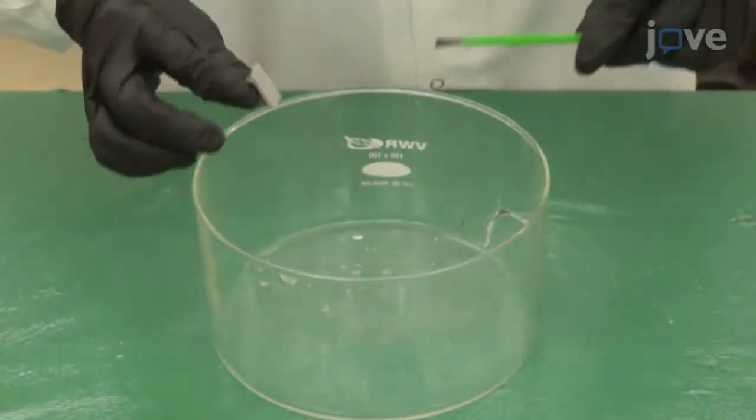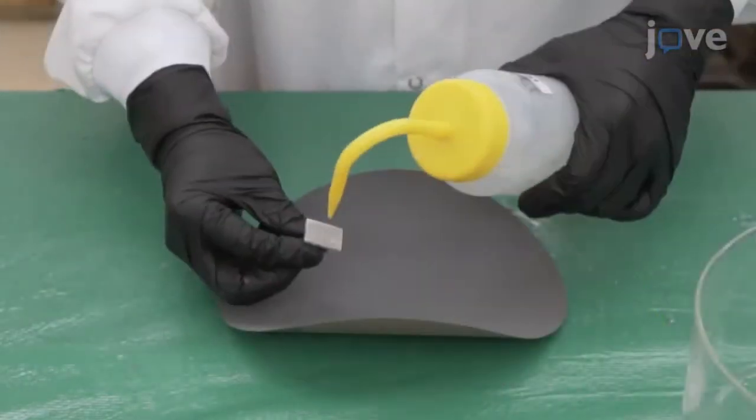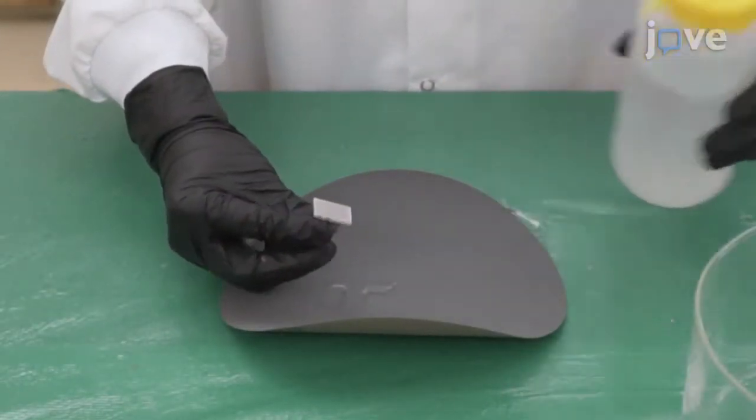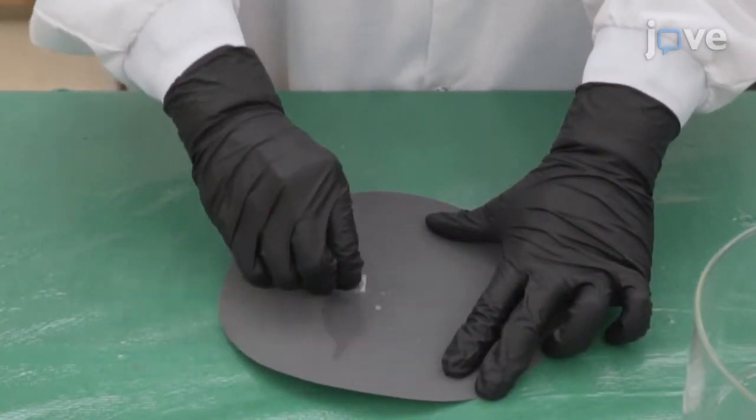Then use a soft brush and running water to clean the sample surface. Rotate and scratch the sample as just demonstrated, using 400, 600, and 1200 grain sandpapers.